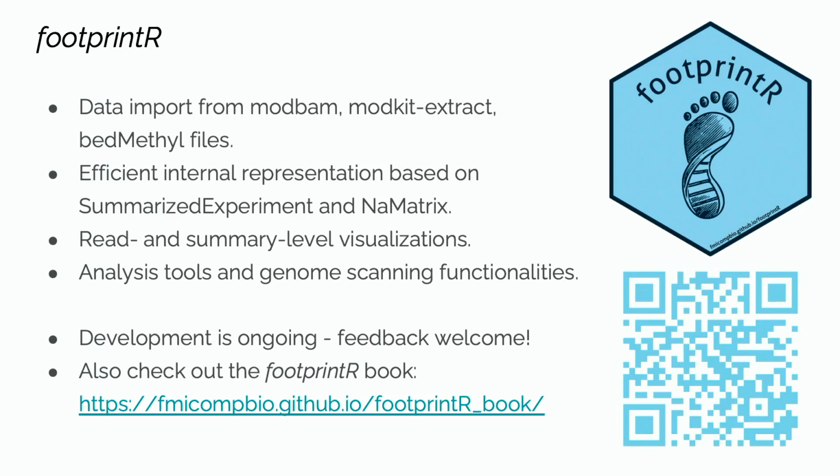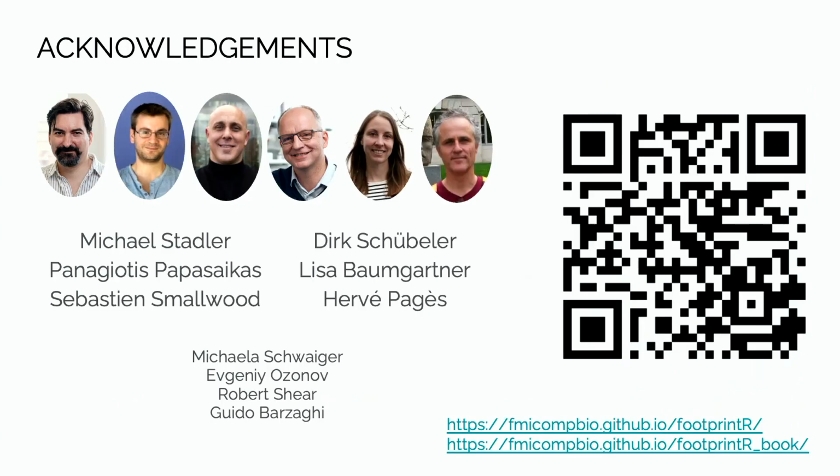So with this, I'd like to round off. I've shown you footprintR, which provides a framework for working with single molecule footprinting data. We can import the data from the nanopore output files. We have this internal representation based on the SummarizedExperiment and the NA matrix for the read level data. We can do visualization, we can do analysis. The development is still ongoing, so if anyone has feedback, it's very welcome. You can reach the documentation here. We also started putting together an online book that shows how to use this for real data analysis on actual data. So with that, I'd again like to thank the people involved, and I'm happy to take questions.